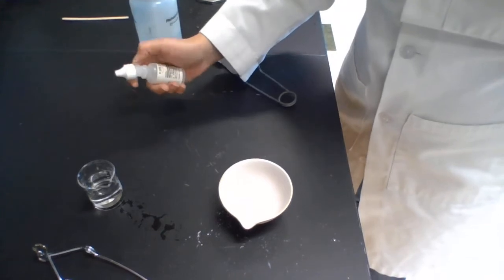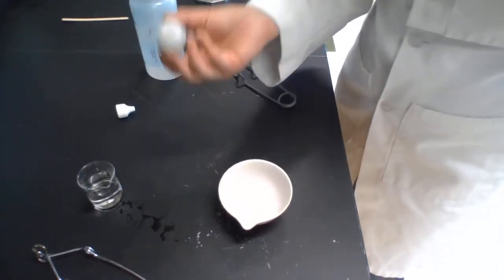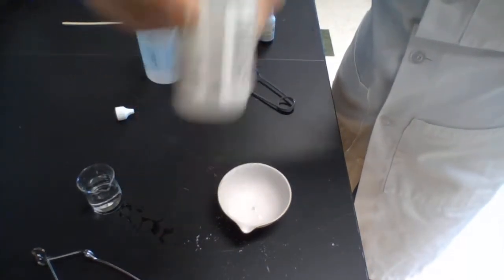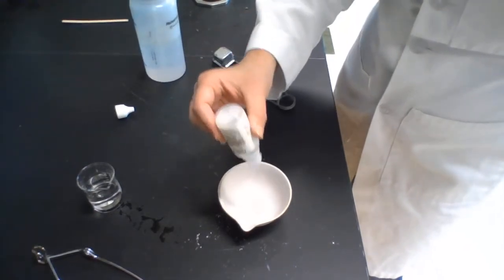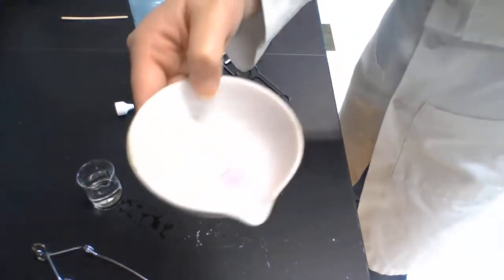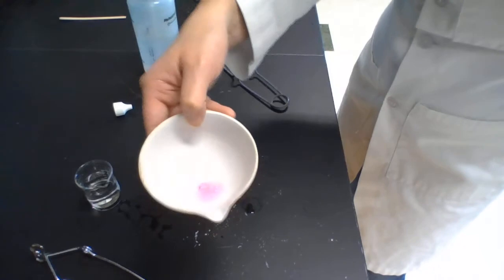What color do we notice? If it is in fact a base, this phenolphthalein, which is colorless to begin with, will turn pink. Okay, so it did turn pink, which is going to prove the presence of a base. So go ahead, pause this video, fill out your information sheet, and then come back and watch the third one.